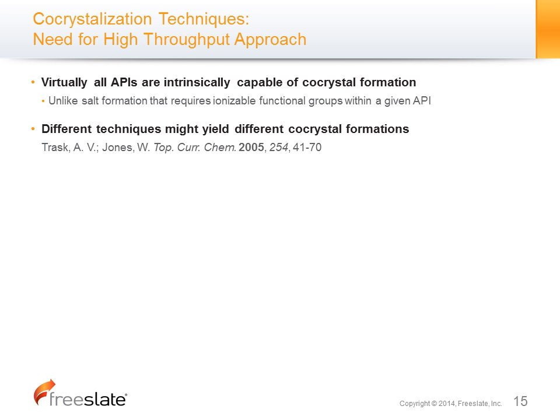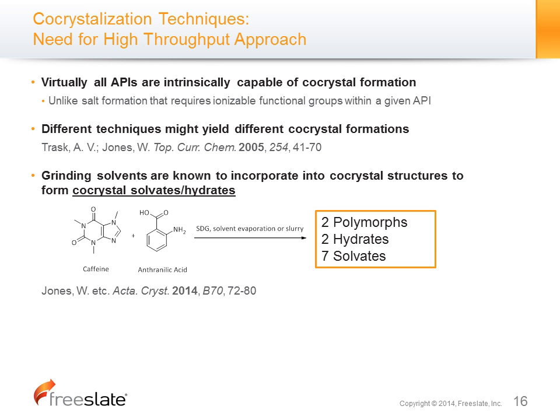And what that means is, at least through study so far, you do form different co-crystals depending on the technique you use. I'm going to talk briefly about what the techniques out there are. And also, this is just to demonstrate what I said earlier. The co-crystal has a possibility to form hydrates and solvates as well.